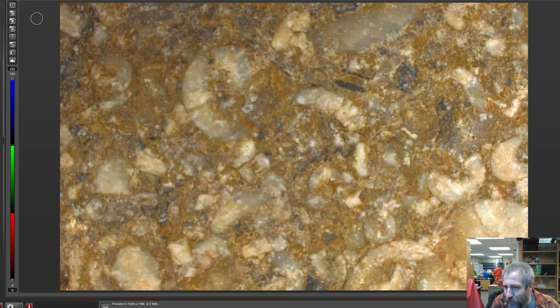Is this a different part of the lab? It's my other lab. It's not my office. I have two labs. There's the SEM lab, which is where the SEM is. It also has other things in there now. The SEM's in one room, and around the corner there's a mercury analyzer that belongs to Dr. Latimer, and so her students are often back in there looking at stuff on the mercury analyzer.